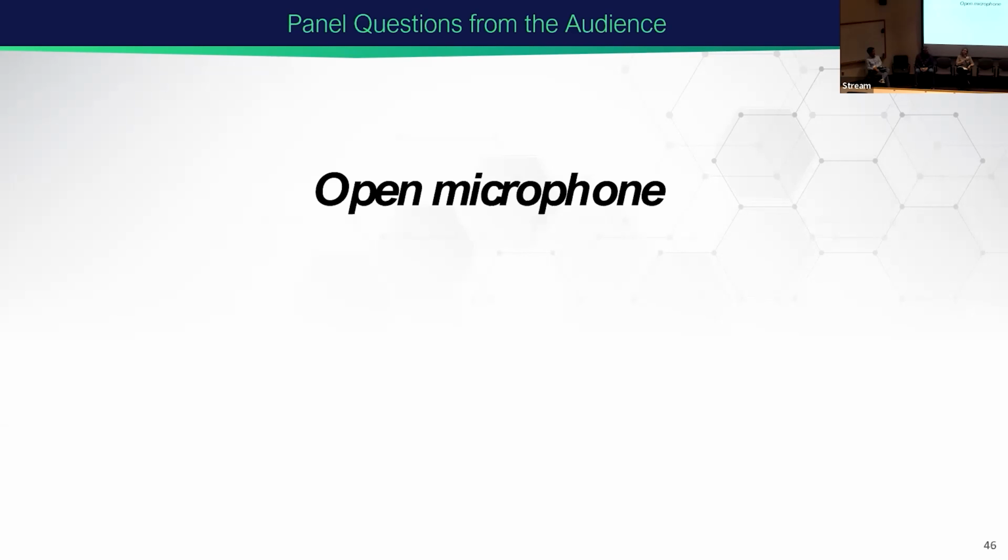And the data you have, maybe you have data that's been collected over 3 years. That's amazing. But did you put in the necessary things to make sure that it could be compared across 3 years? Correct. We didn't before. We're now aware of this. And I think EMSL can make a big impact in this, where we can generate a huge amount of data that can be comparable across years.